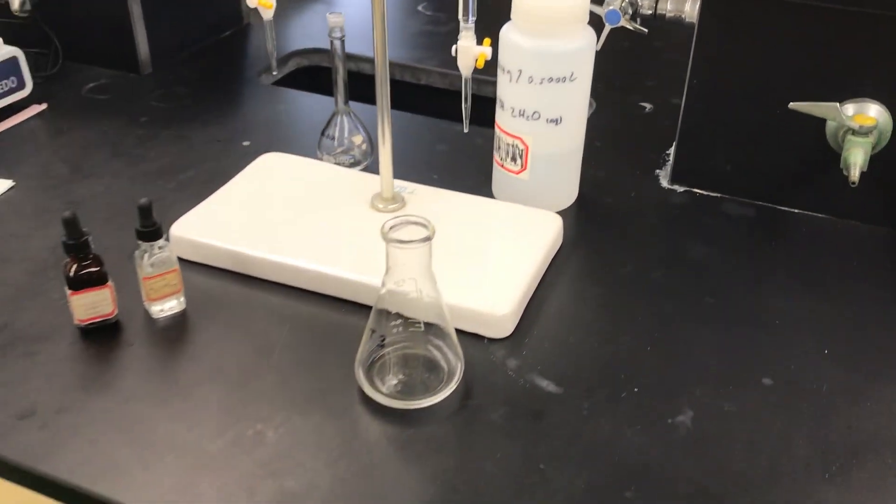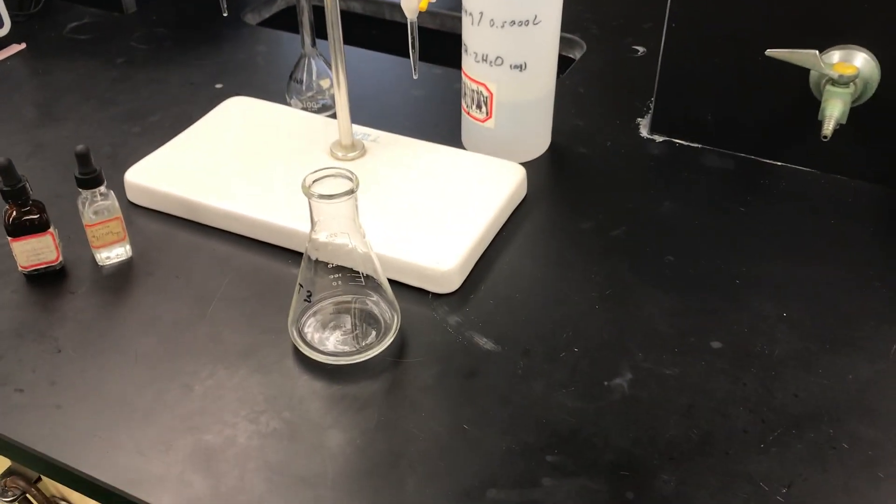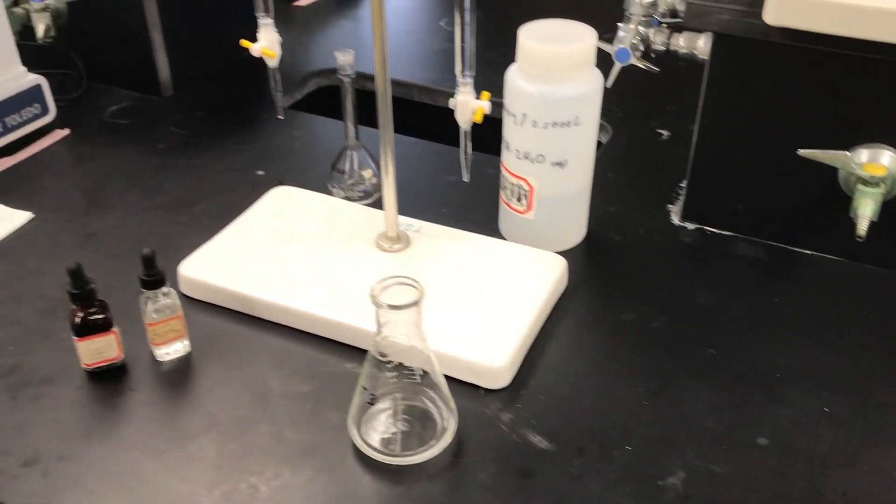Hello folks. I'm going to demonstrate here a calcium EDTA titration just like would be specified in our quantitative analysis lab. Let me quickly show you the experimental setup here.